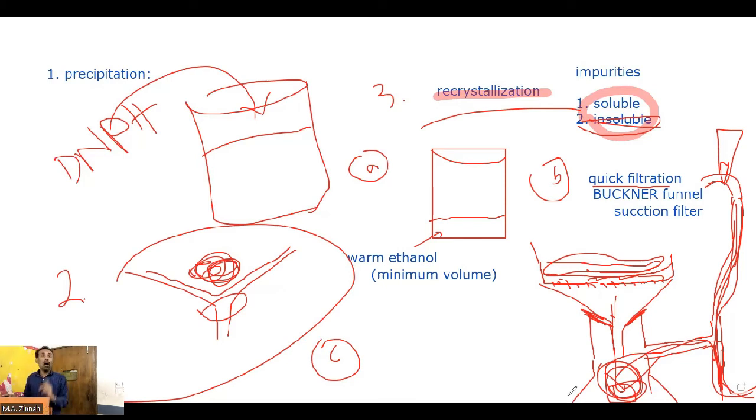এই ক্রিস্টালকে আবার ফিল্টার করতে হবে। So the third step is for crystallization. This is the recrystallization actually, and then D কি? Follow আবার filtration, again filtration with the same funnel, the last D. এখন এই যে লাস্ট আবার যে ফিল্টার করলাম, এটাতে কি হবে? Finally you got the crystals.